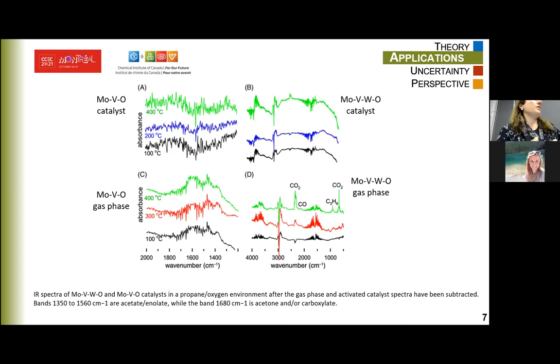So maybe, for example, in this case, this is a catalyst for partial oxidation. If a catalyst is working under an oxidant atmosphere at 400 degrees, and the characterization is taken under vacuum, at a very high temperature, maybe I'm looking at a different thing. You know, that's why of the importance that Miguel Bañares told us in the previous talk about the operando methodology, to be able to analyze the catalyst at the moment that they are working. So that's why I wanted to show you this example like a past.